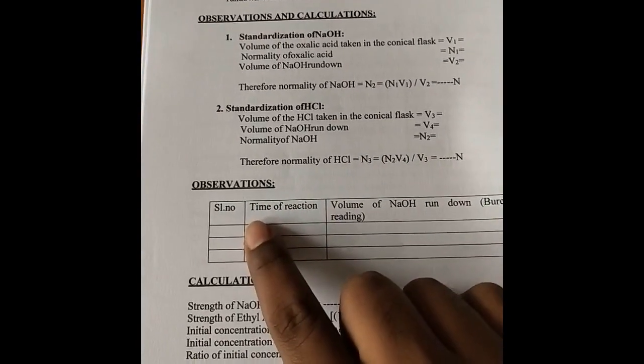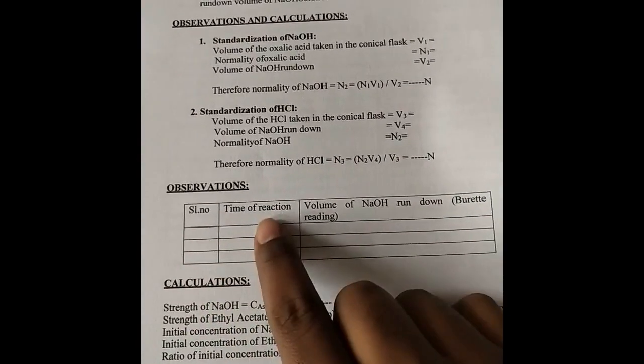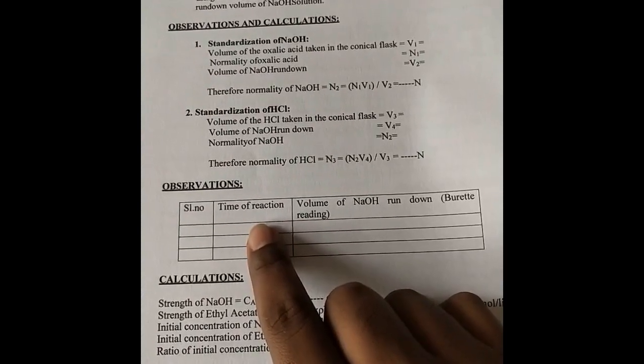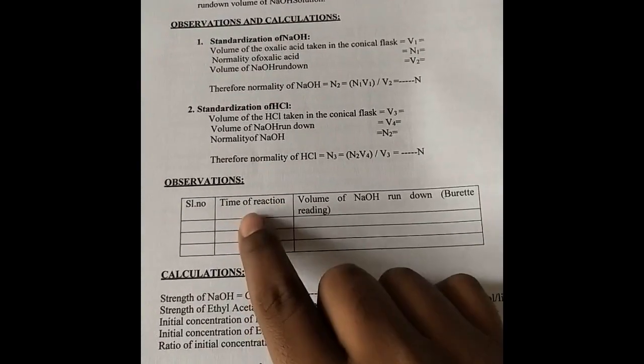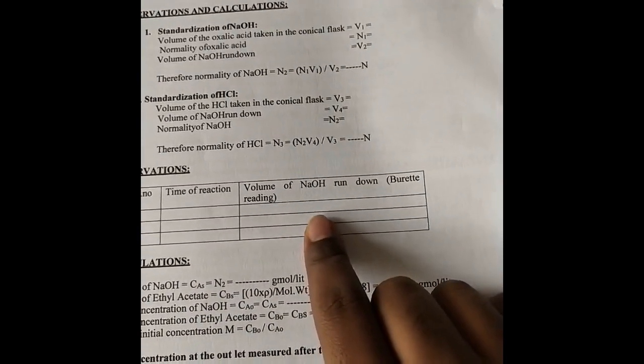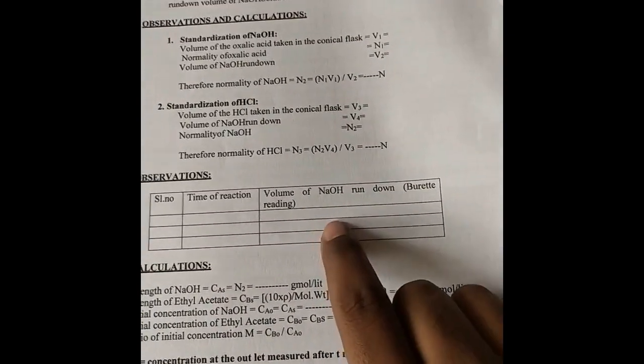Then the observations. Serial number. We have taken different values at different intervals of time, starting from 5 to 60 minutes. So we need to note down the time readings in the first column, and the volume of NaOH rundown, that is the burette reading, will be in the second column.